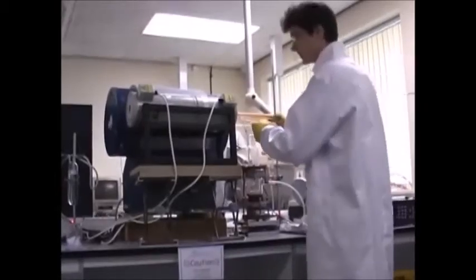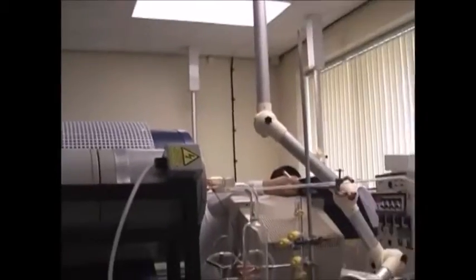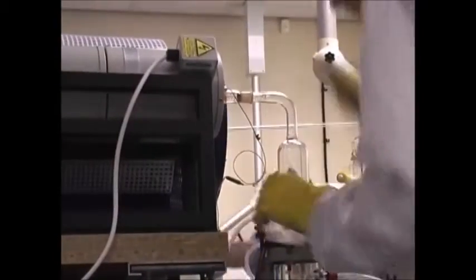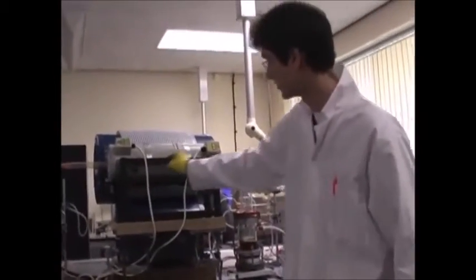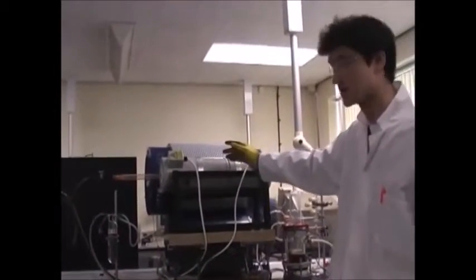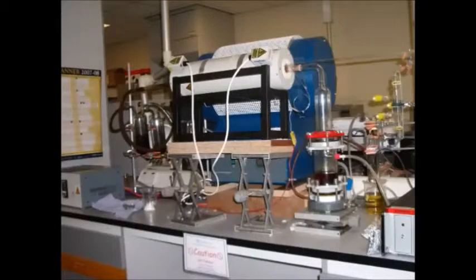The young scientist takes a clean tube and sets up the experiment. He introduces a clean base in the tube and closes all empty space with heat-resistant cotton to keep the heating. An unreactive gas is passed through the heated solution of the hydrocarbon. The mixture passes through the furnace where the temperature can be from 300 up to 1150 degrees C. He can run the experiment for as little as 5 minutes up to hours in order to get longer tubes.